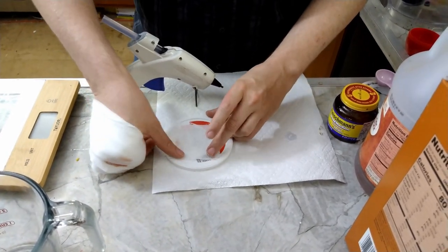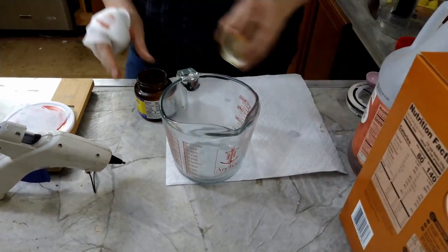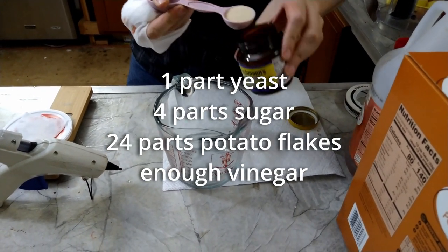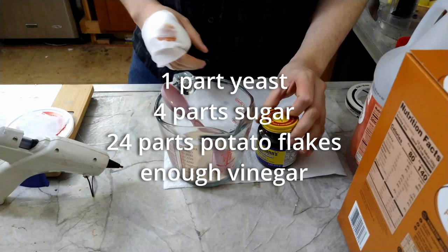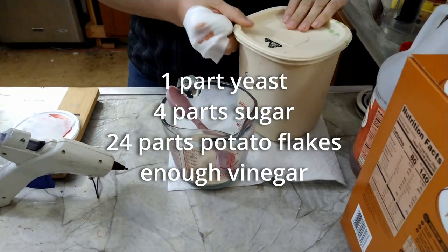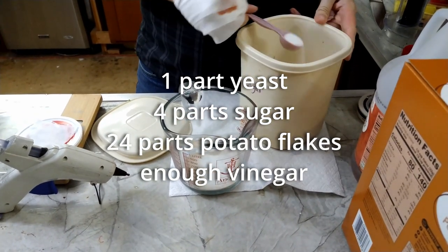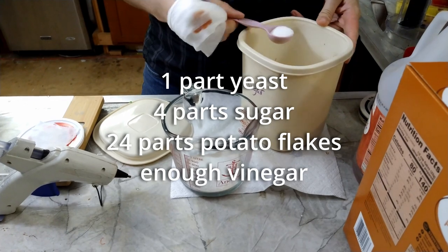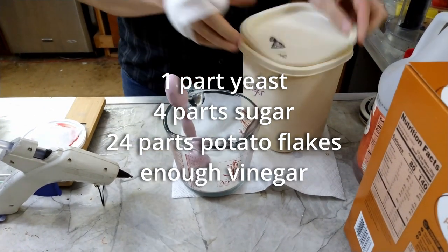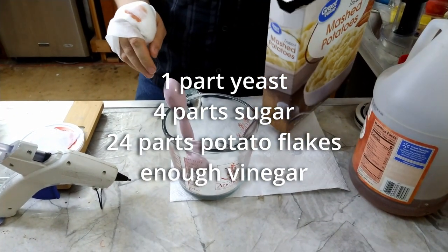The best part of hot glue is burning yourself. Recipe is pretty simple: one part yeast, four parts sugar, twenty-four parts potatoes.